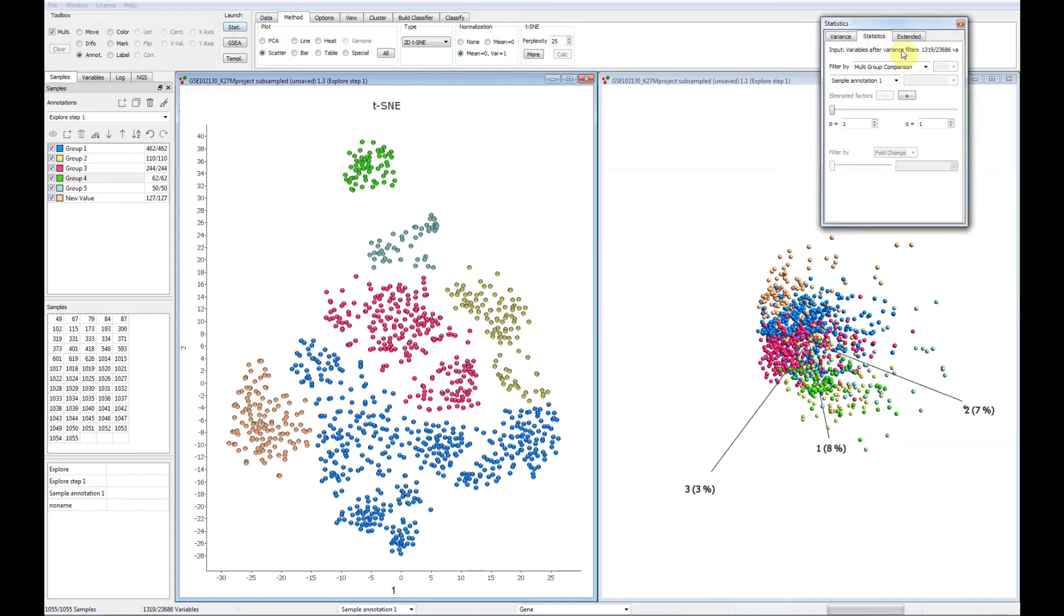To summarize, CluCore Omics Explorer provides easy to use T-SNE plots and the tools you need for single cell data analysis.